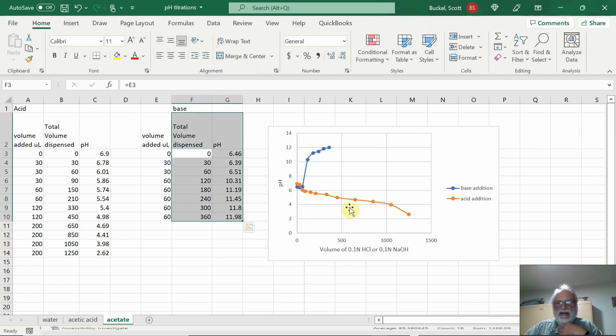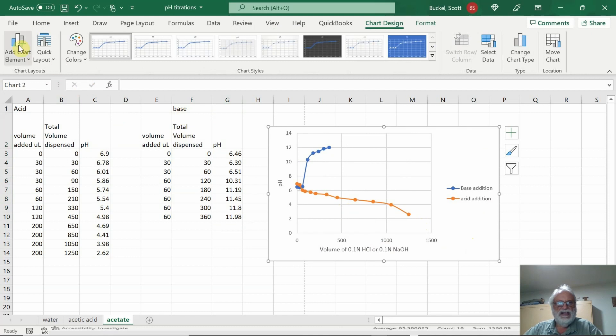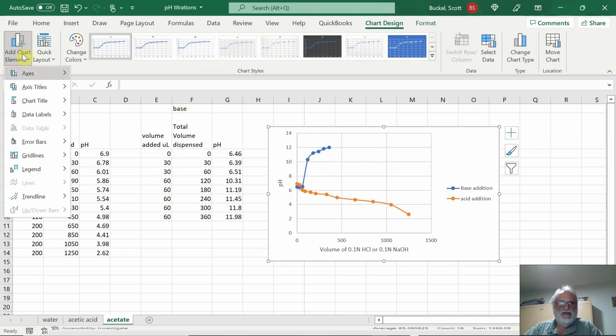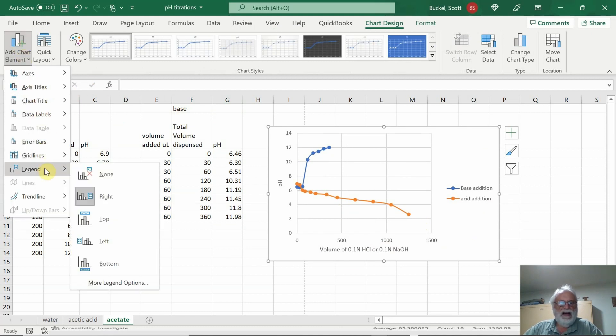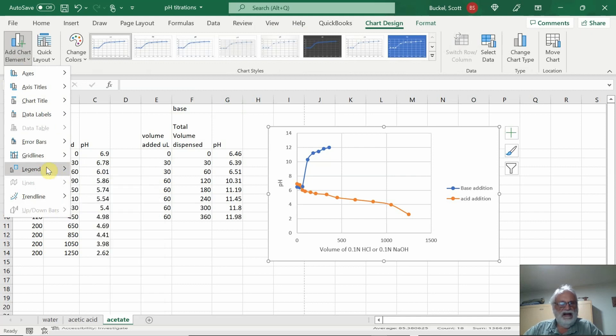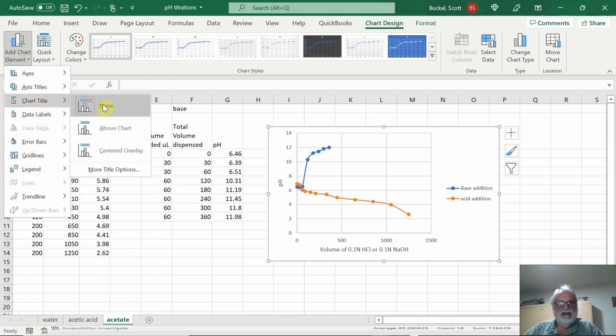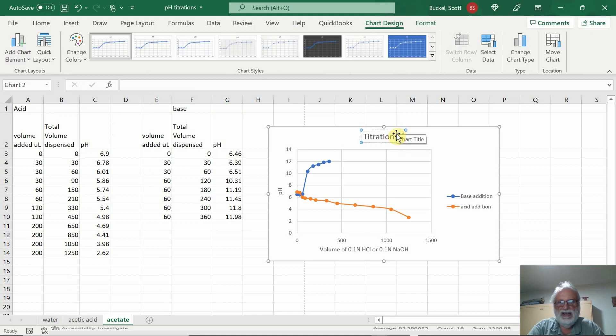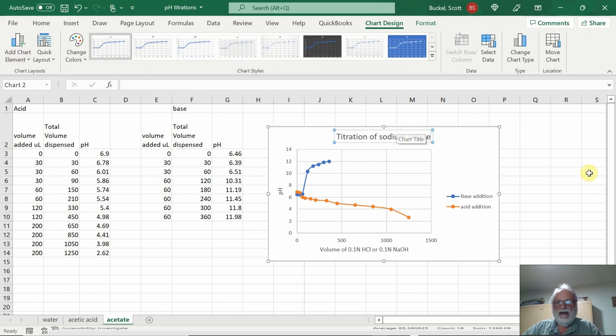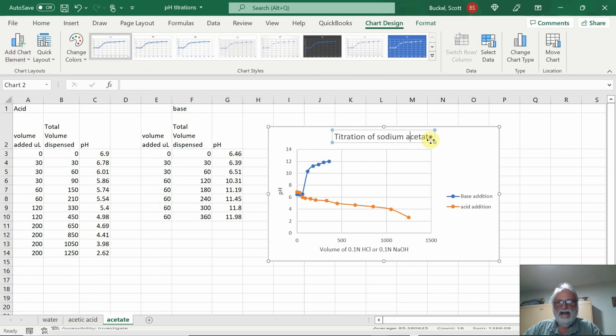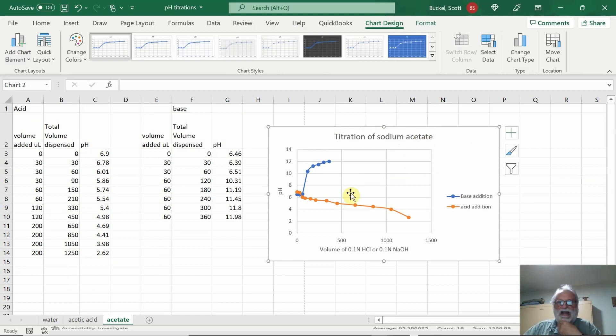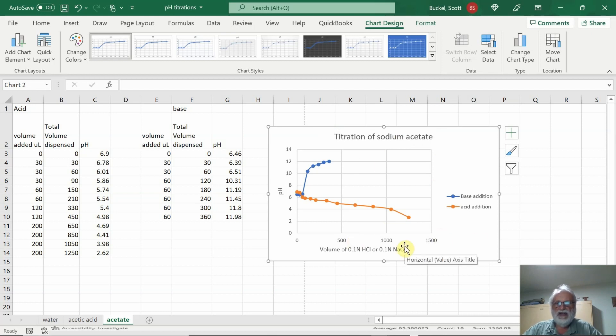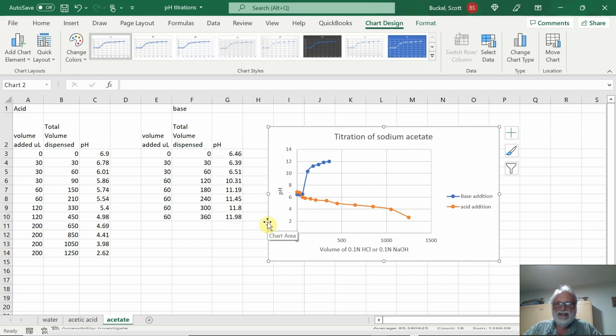So you have a nice little graph. And you might want to add a chart title. It's not absolutely necessary. It does not substitute for a figure legend, but we go ahead and put a chart title on top, above chart. We'll go titration of sodium acetate. I always like to go ahead whenever I'm doing all my graphing and all this stuff, I always put chart titles on. Sometimes I eliminate them before I copy them, but I like to have them there. So as I'm generating, you guys would be generating four different plots sort of like this.